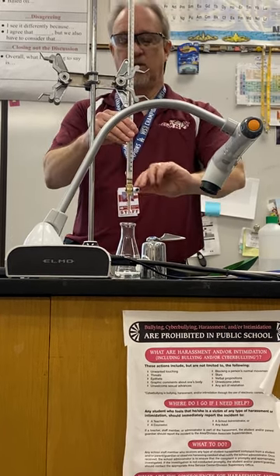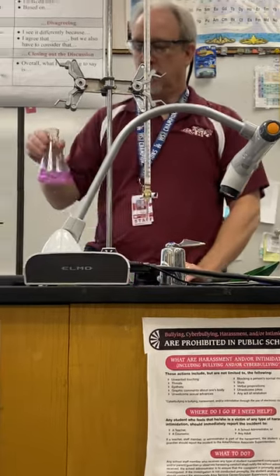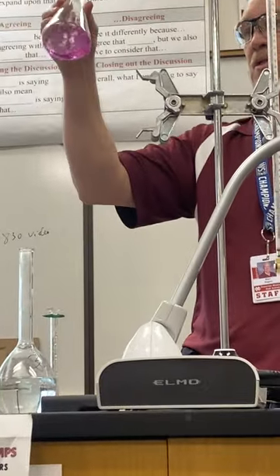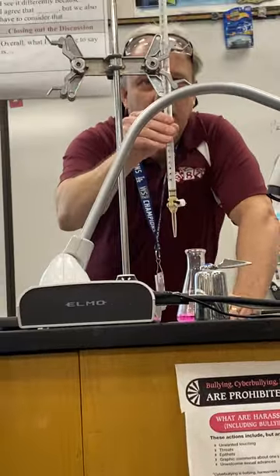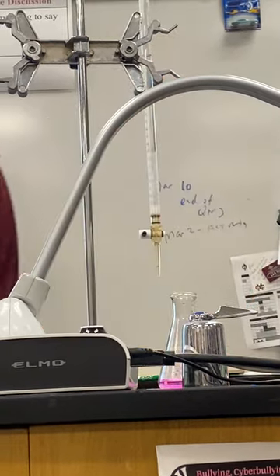When I do a little bit, I'm just doing a 180 degree turn on this. That's really an overshoot, but it was only one turn. So that's what you're looking for, that color. So now I look at my buret. I'm at 29.99, looks like.